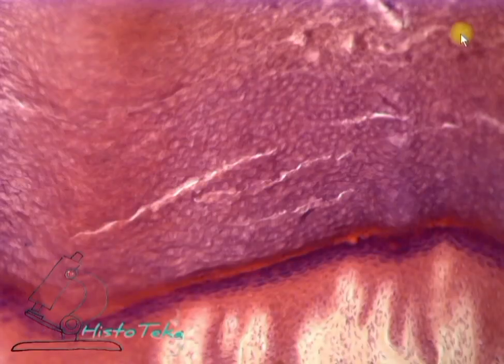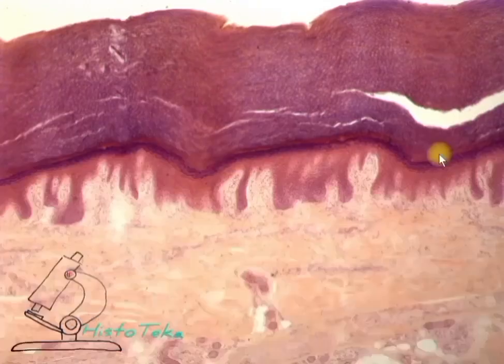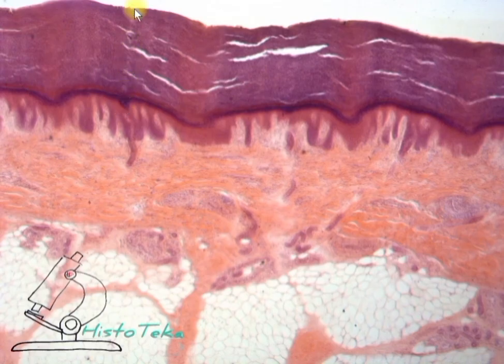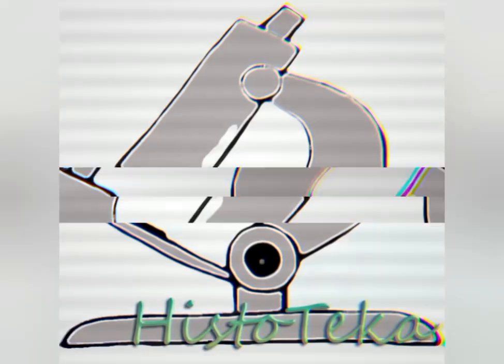Well, the thickest surface layer of the epidermis is corneous, also named stratum corneum. It's composed of more than 20 overlapping layers of polyhedral anucleate cells sandwiched between layers of lipid. Corneocytes are also not cells. They are already postcellular structures. And also, in this preparation, the excretory ducts of sweat glands may occur in the epidermis. They look like these tracts in the stratum corneum.